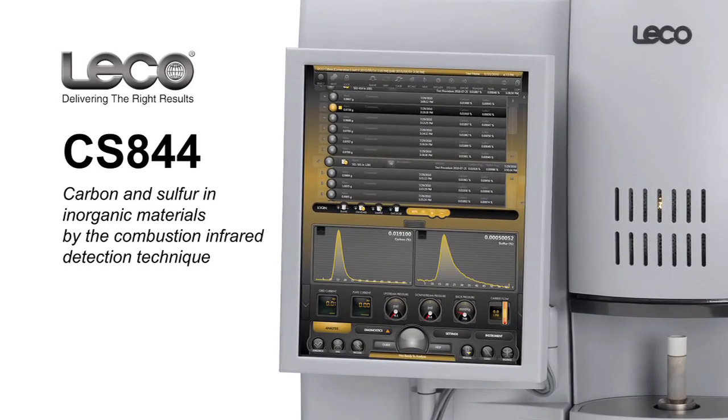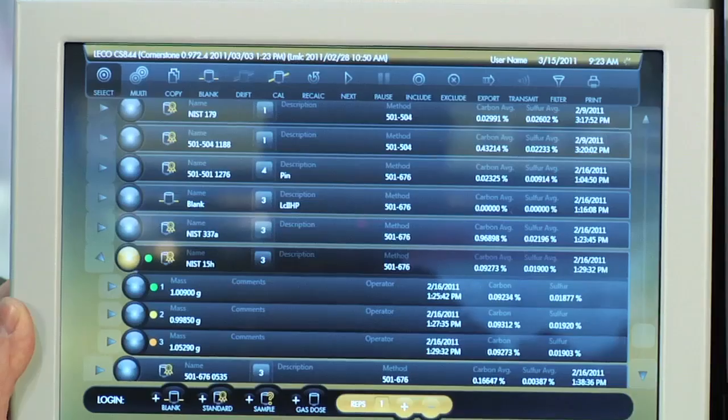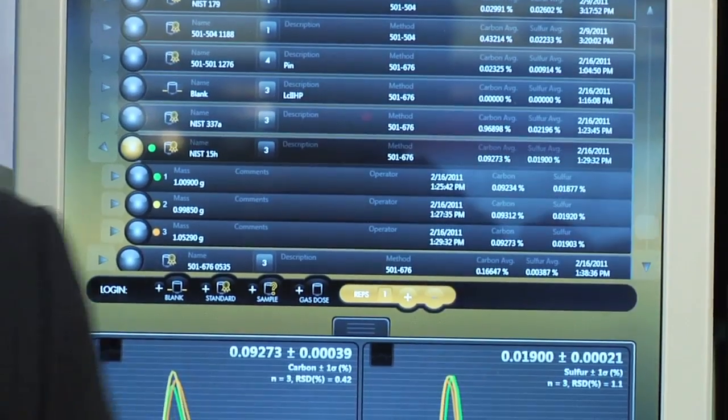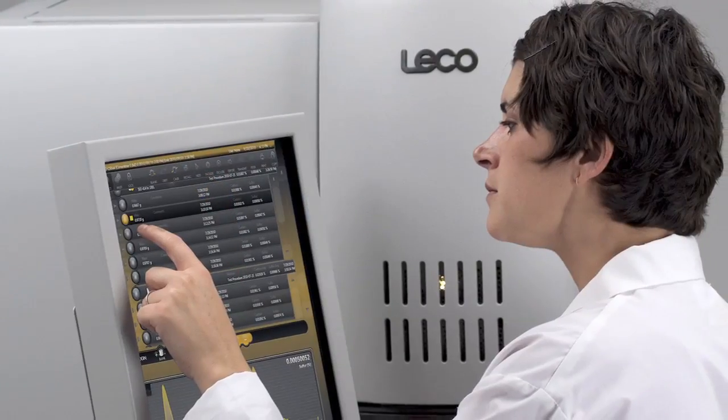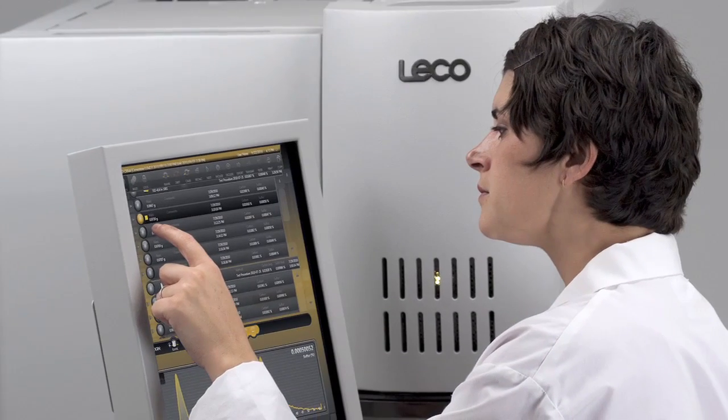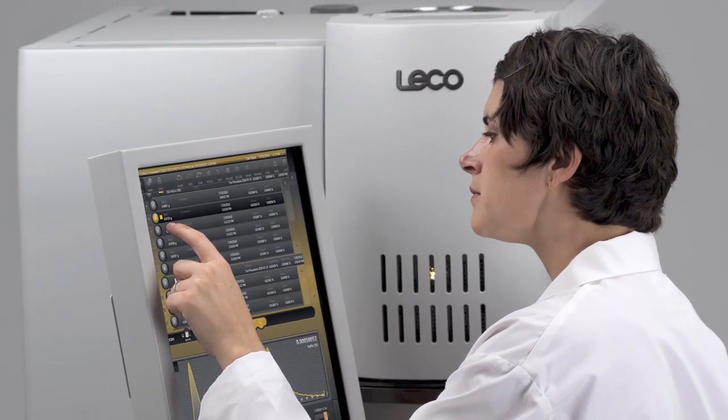There are several features of this system that I would like to introduce today. The first of which is our touch user interface here on a touchscreen boom mounted to the instrument. The goal of this touch user interface was to provide a rich and dynamic user experience to allow ease of use.